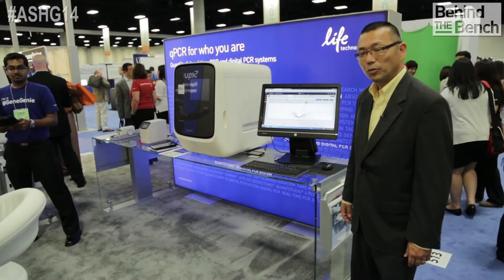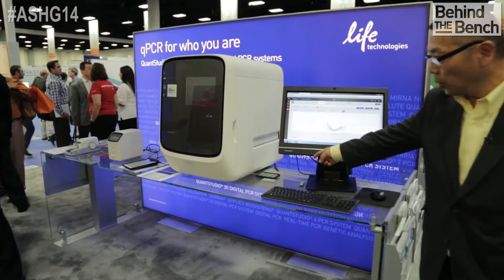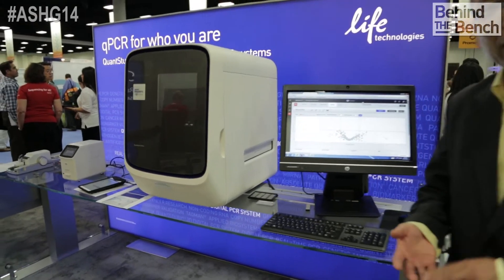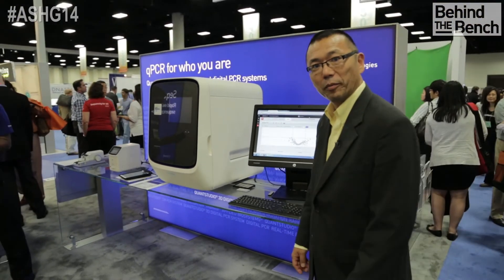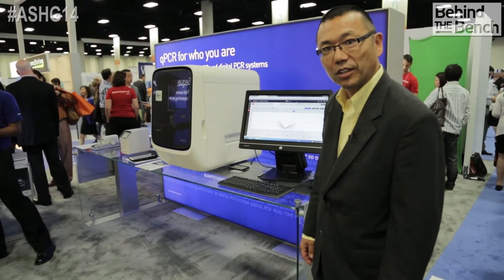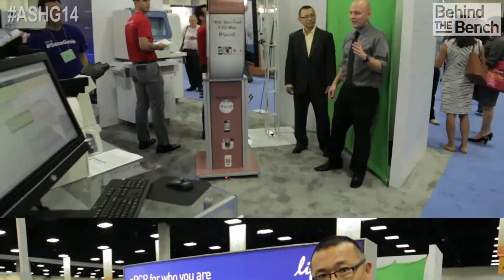In this section of the booth we're highlighting the QuantStudio 12K Flex. As you can see, there's an open array plate, and there are interchangeable blocks for a 384 TaqMan array card and 96-well formats. Behind it is the QuantStudio 3D for digital PCR — and there's a lot of interest in digital PCR at this show.